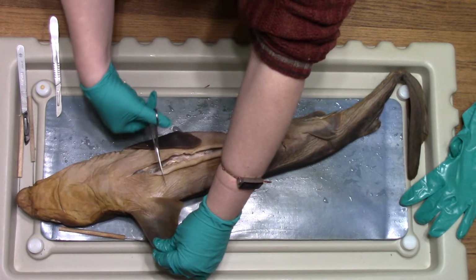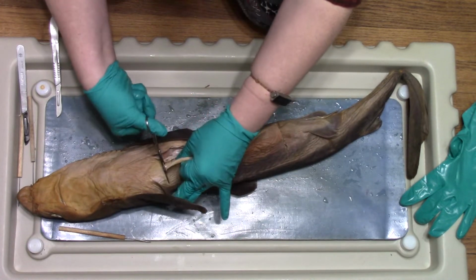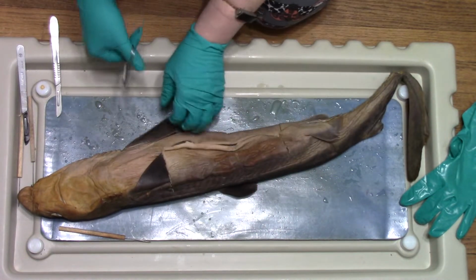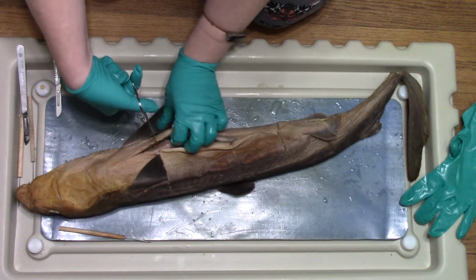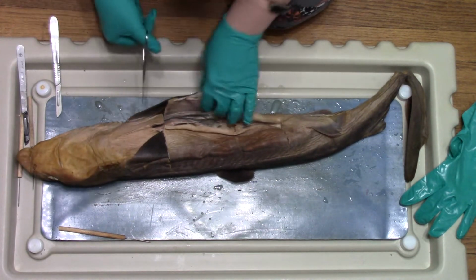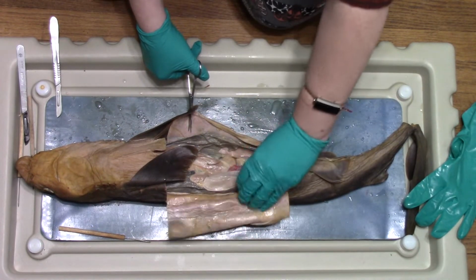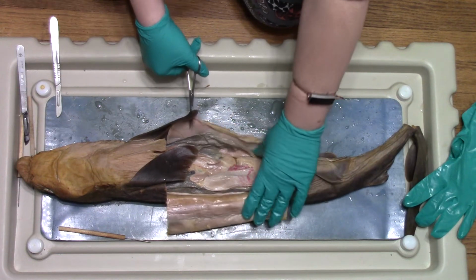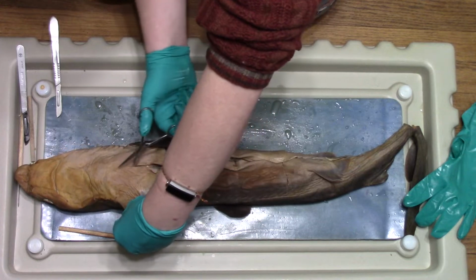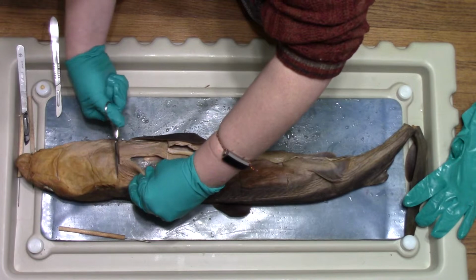So pectoral fin, you're cutting sort of in her armpit, just so you can push that flap out of the way. And this is why it's nice to have it on one side, because then you only have one piece that you have to pin down instead of two. And then, if I can do it here.